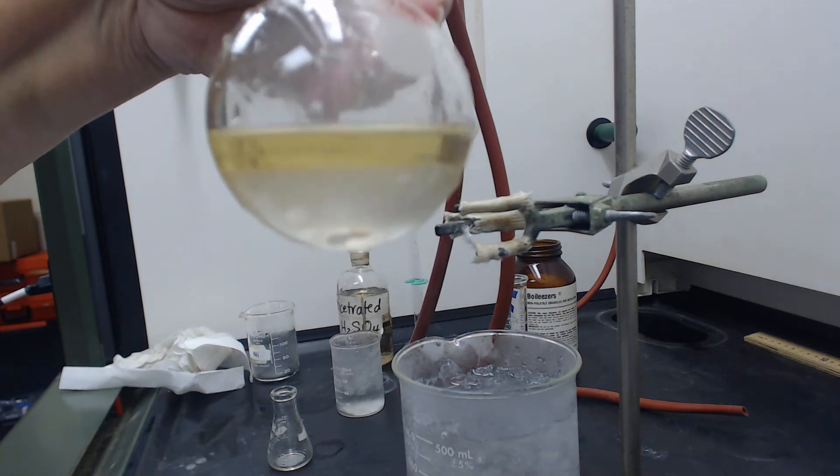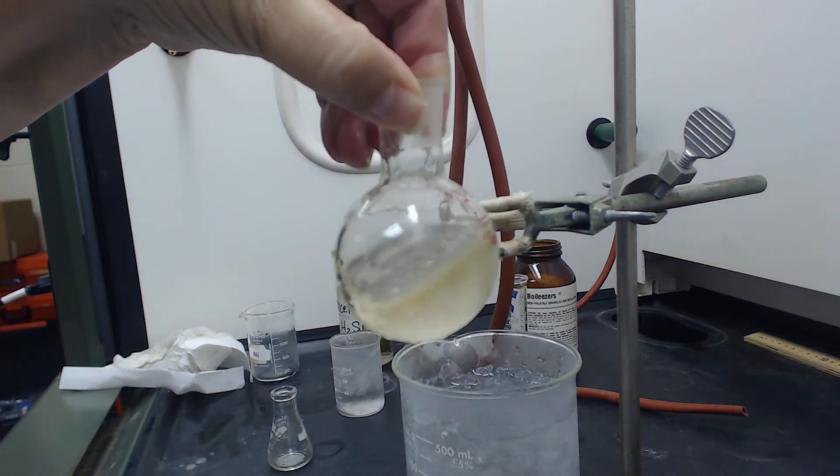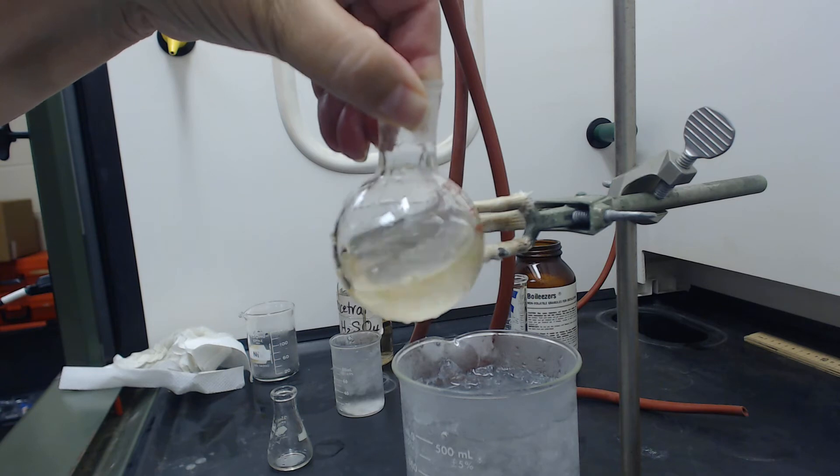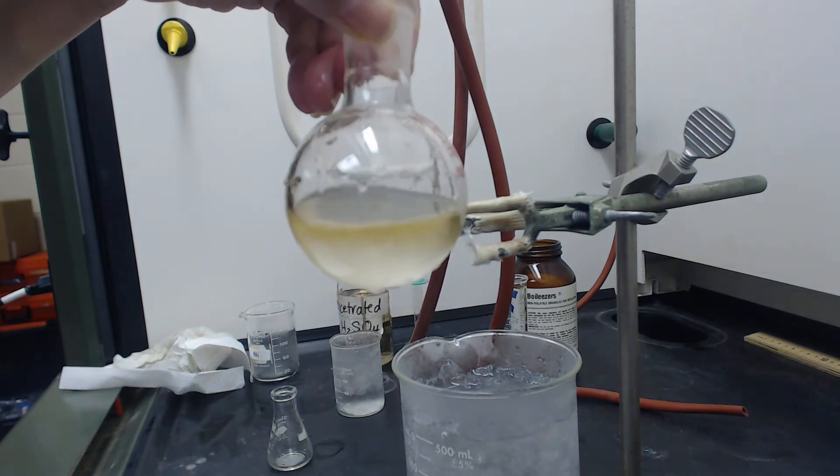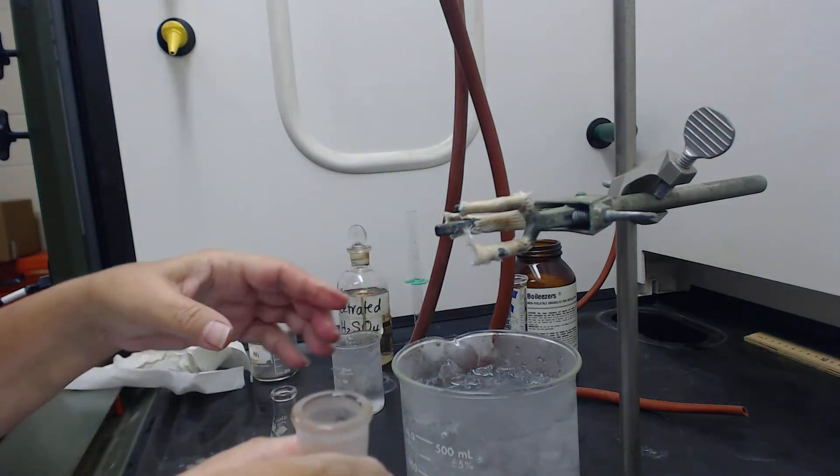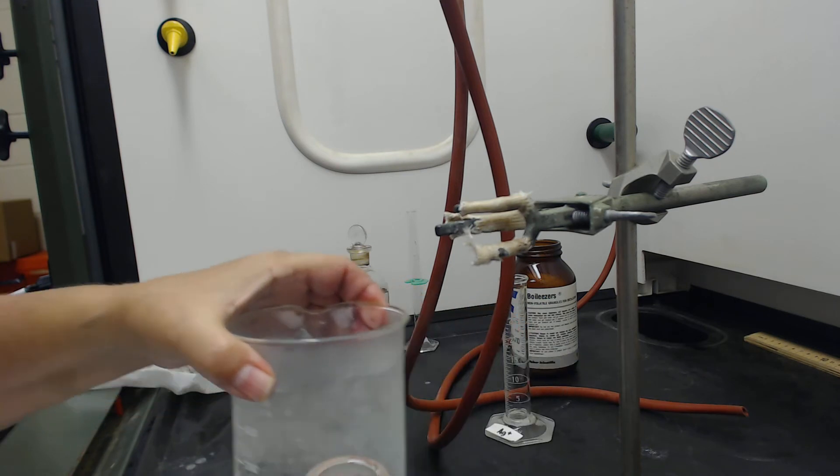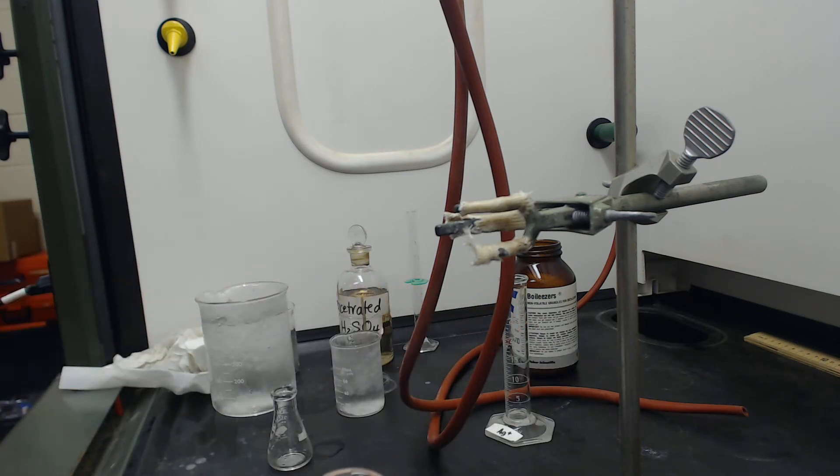All right, so I've added all the sulfuric acid. You may or may not be able to tell, but there's actually two layers there. We're going to swirl it a little bit, but that's all right because we're going to reflux it. We're going to boil it together.